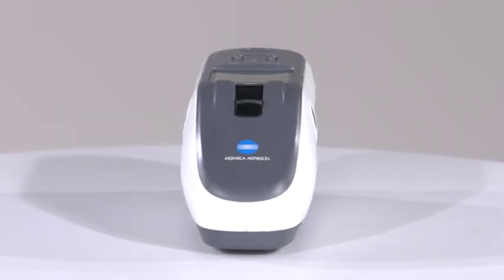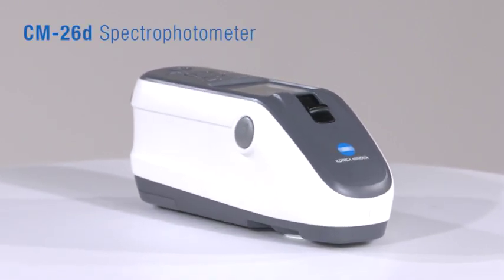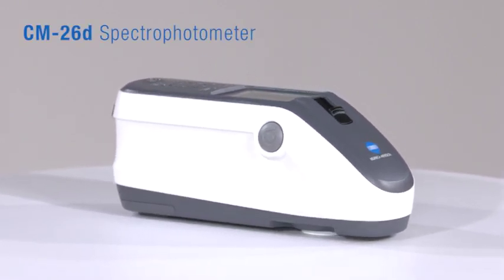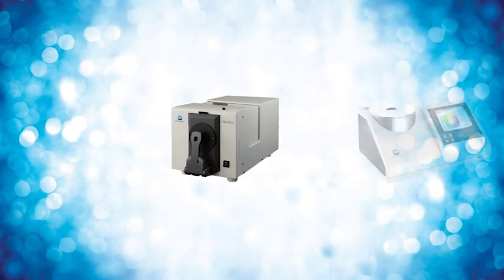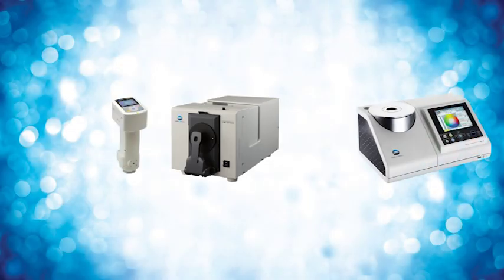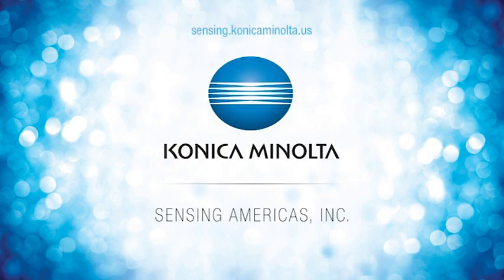Developed to meet the sophisticated needs of today's manufacturers, the all-new CM26D portable spectrophotometer provides reliable color management throughout the global supply chain. To learn more about Konica Minolta Sensing's full line of color measurement instruments, visit us online at sensing.konicaminolta.us or call 888-473-2656.